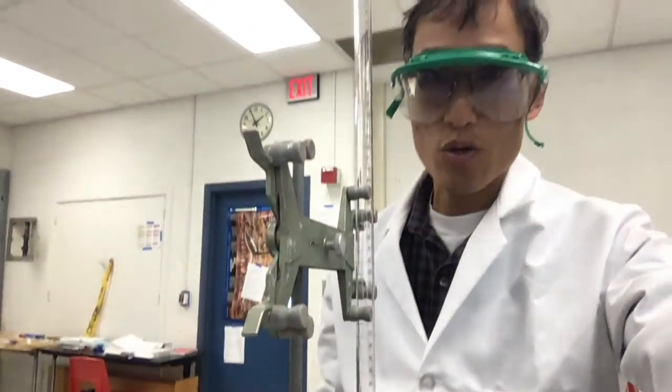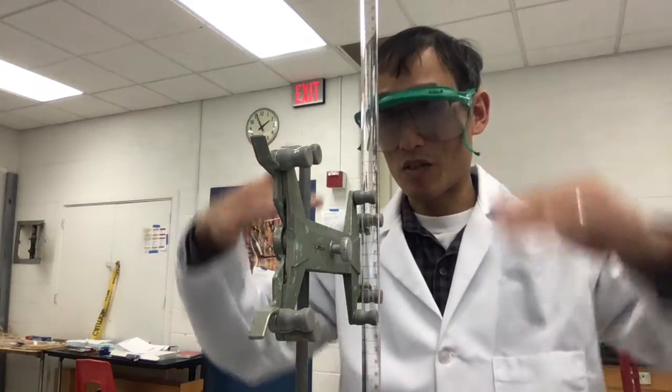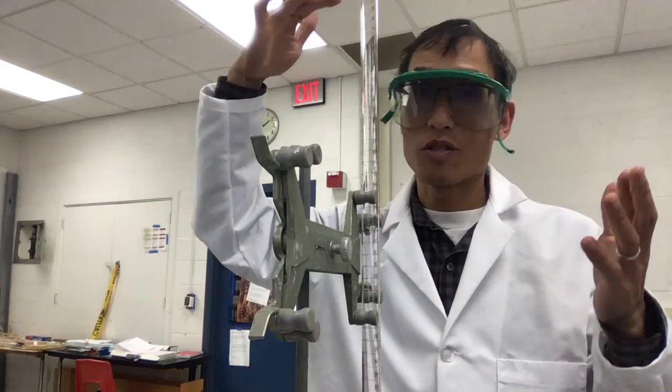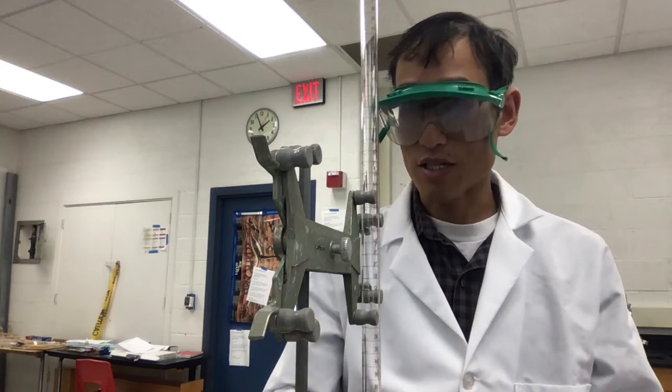Ideally, I know that in the simulation you should be higher up. The Burets should be lower than eye level, but I'm not going to step on a step stool to get up here. This is about as low as it can go. So I'm just going to be safe, keep our goggles on at all times.